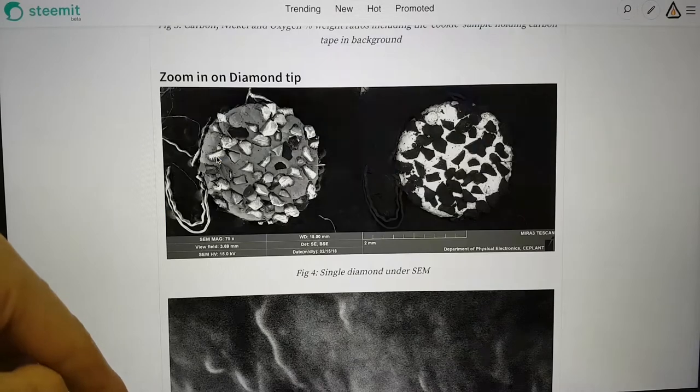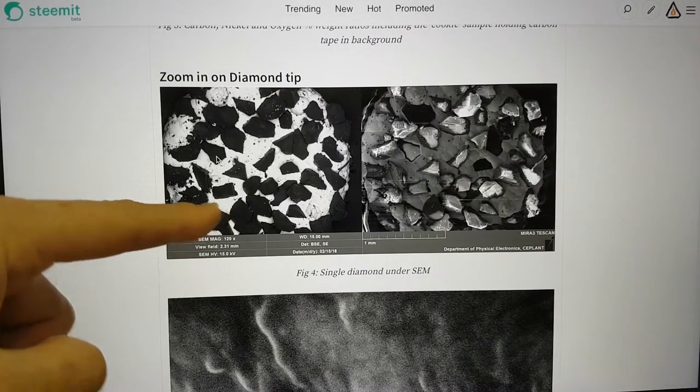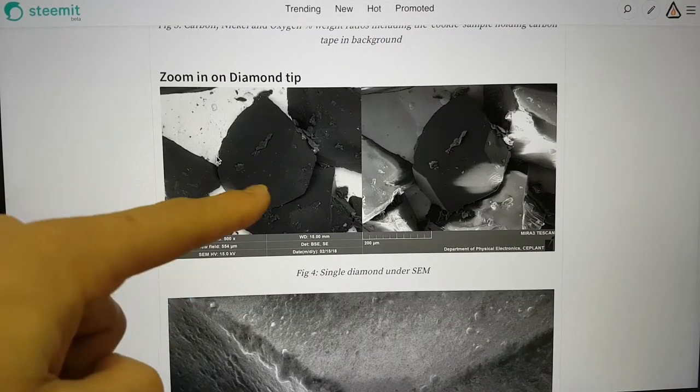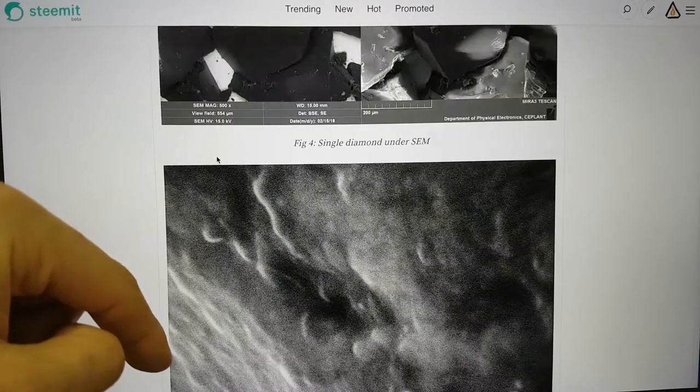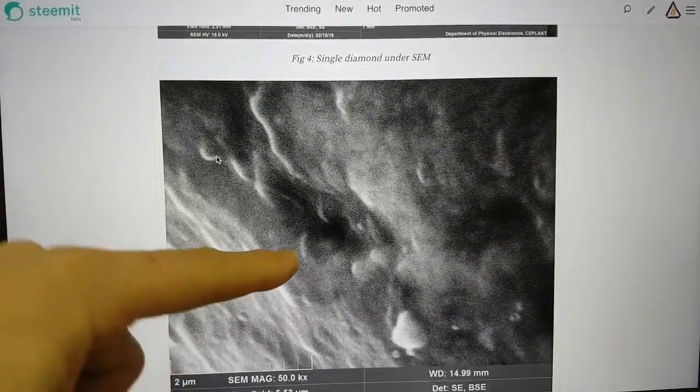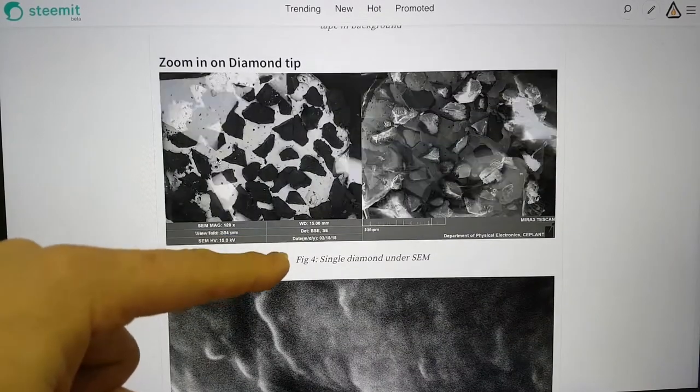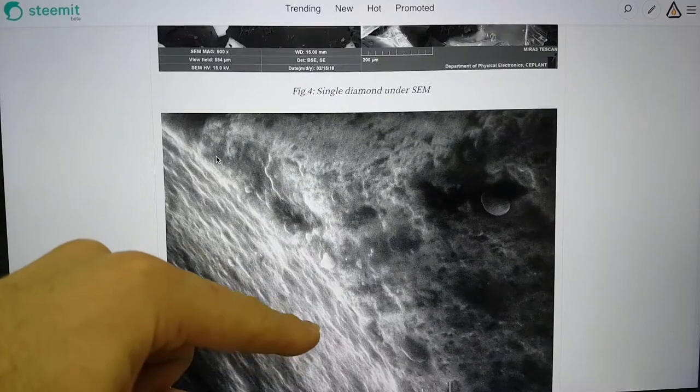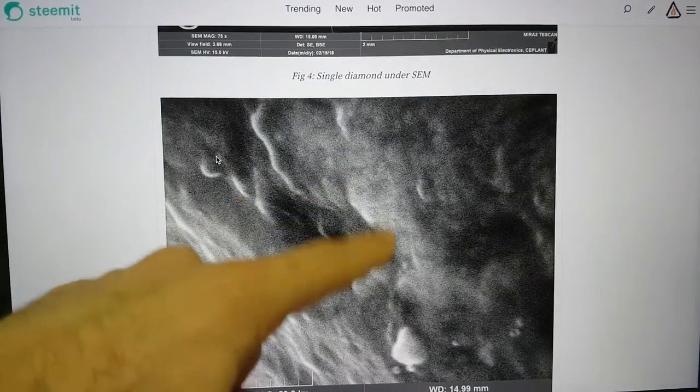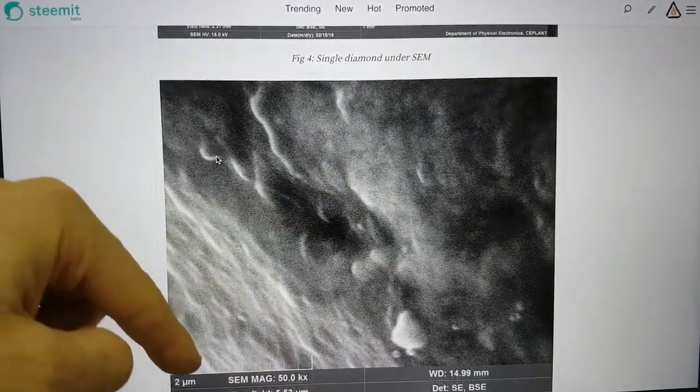However when we delve in a little bit closer, when we zoom in, here's a diamond, a single diamond here. When you look at this up close on the tip, we're actually looking at this diamond on this tip here in this SEM image, right close in.